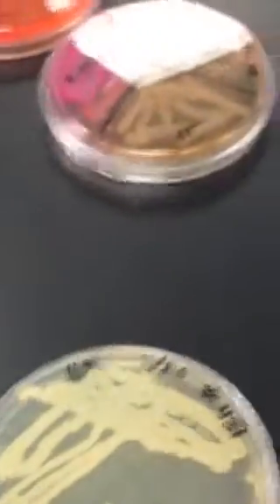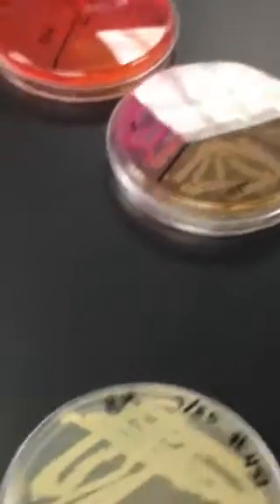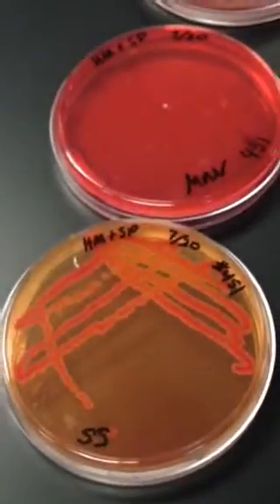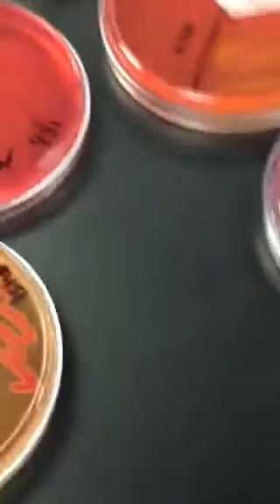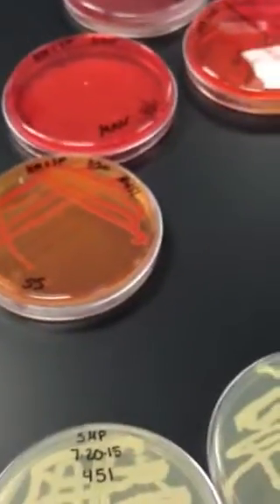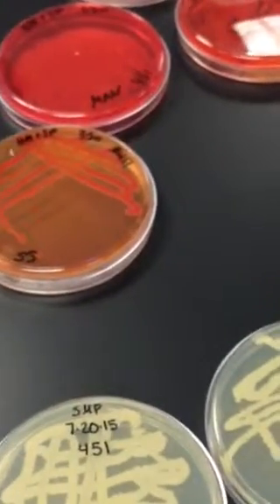Last one. What about the E. coli? Does it grow on Salmonella Shigella agar? I think it does. And you'll get some milky pink. So Salmonella Shigella agar also has lactose in it. So if you get the pink colonies, it's a lactose fermenter. Salmonella is a non-lactose fermenter, turns black. So if it's black, it's a non-fermenter, unfriendly. If it turns pink, it's a fermenter, friendly, could be E. coli or some other gram-negative bacillus like E. coli.